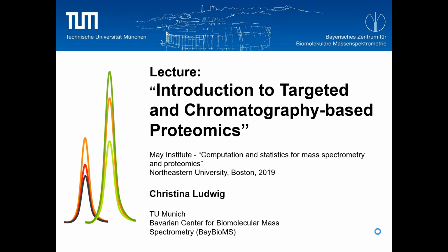It's a pleasure to be here, and I would like to give now a little bit more of a basic introductory lecture than what we have just heard from Sue. So the purpose of my presentation is to introduce you to the basic concepts and principles of targeted and chromatography-based proteomics. I assume that there are maybe people here in the audience that are already quite experienced in doing SRM or targeted proteomic experiments. But I think there are also a lot of newcomers, and so this lecture is especially for those people who are maybe not so experienced, and we will also have quite some repetition of things using slightly different words or different slides than what Sue said already.